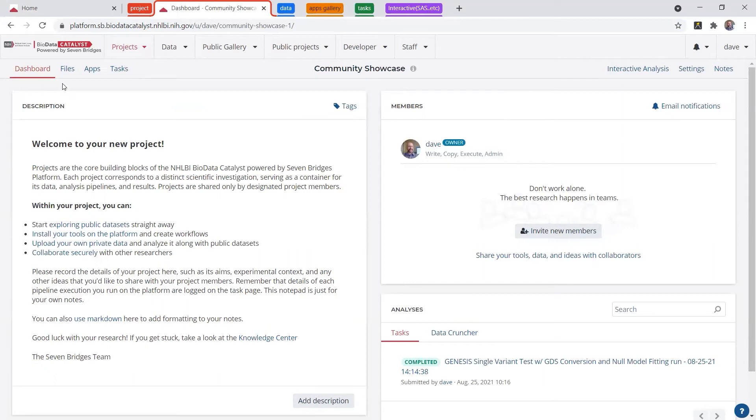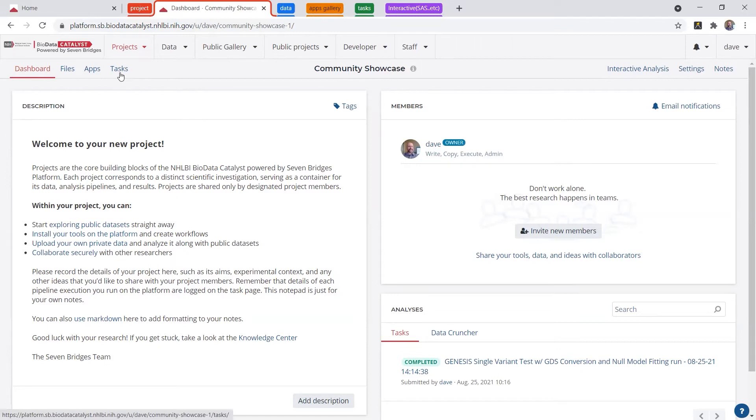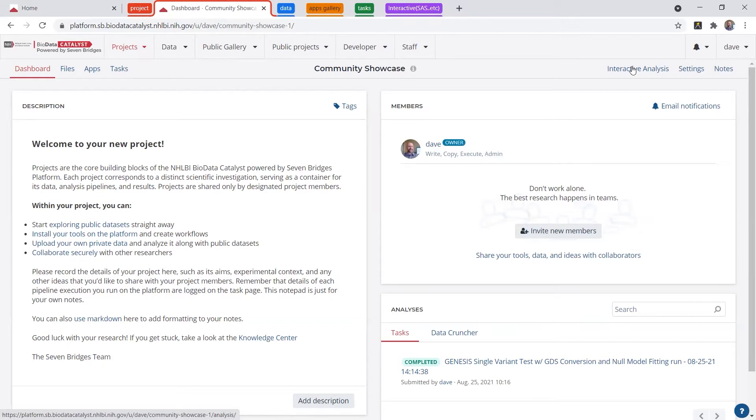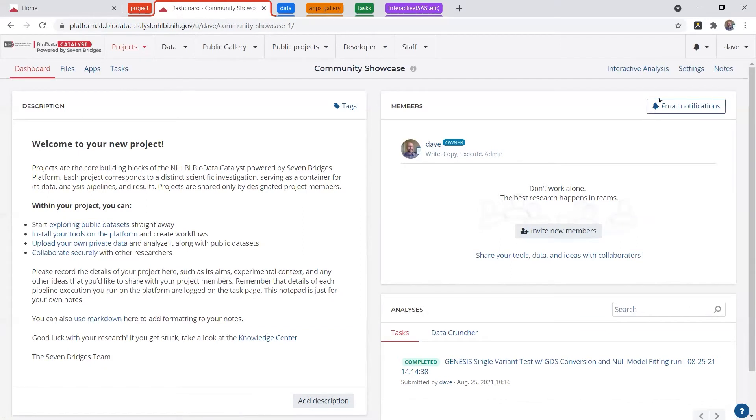Along the top, you have access to your project files, your project apps, your analysis tasks, and on the right side, you'll be able to access some interactive analysis, which I'll tell you about later, as well as some settings such as changing the project billing group.